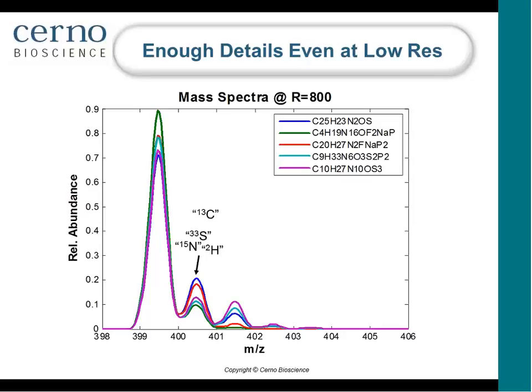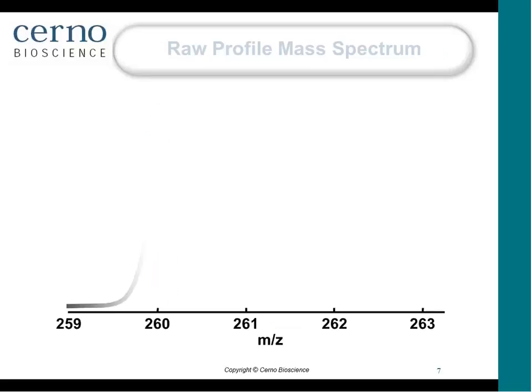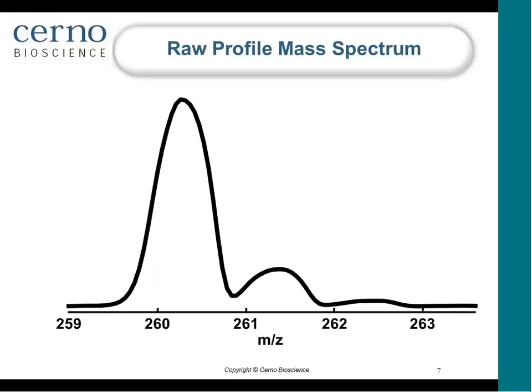The processing of raw scan profile mode requires, however, a different type of mass spectral calibration, which you can see on this next slide. Because the conventional mass spectral calibration would require a standard of known elemental composition, and it will just set up the mass spec to run in the profile mode, either during the mass spec tune process or during a more elaborate and separate instrument calibration process.